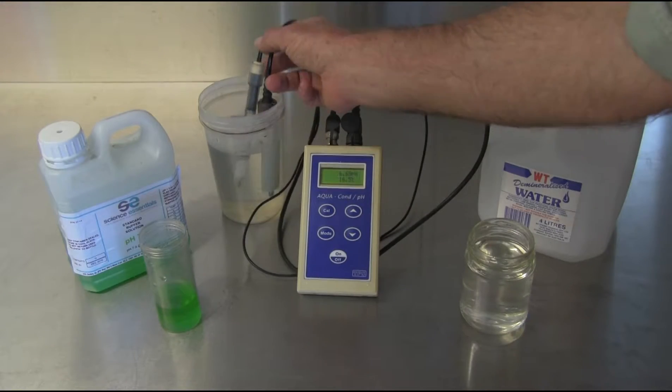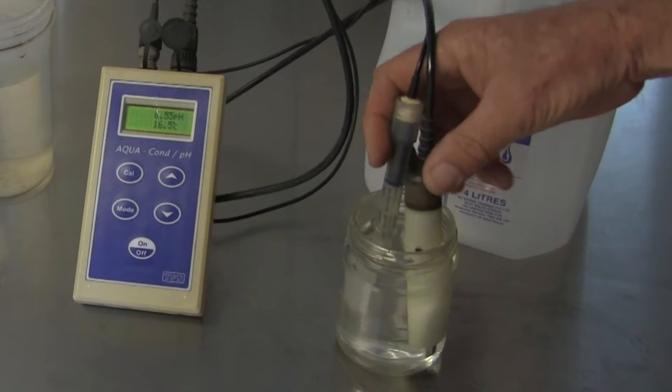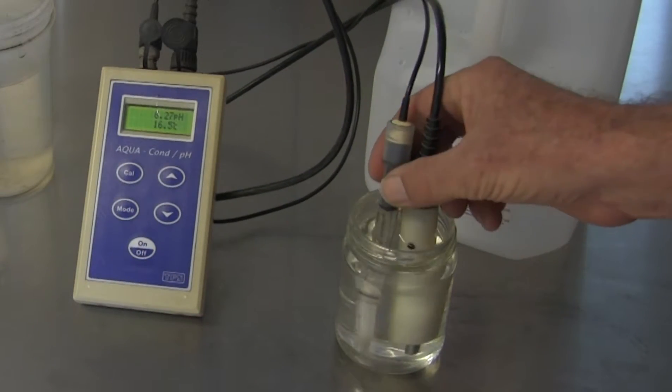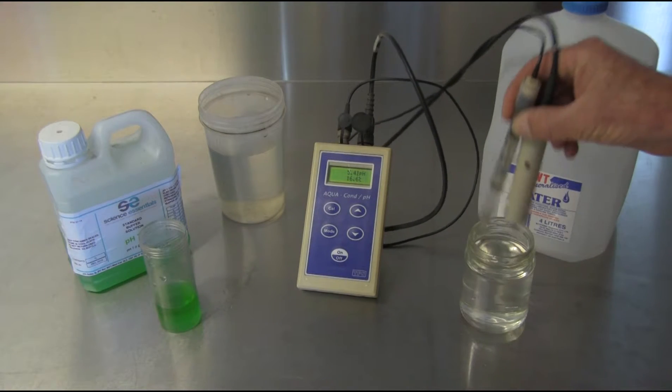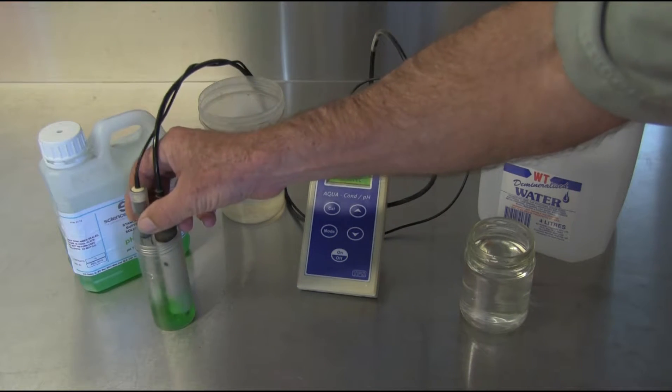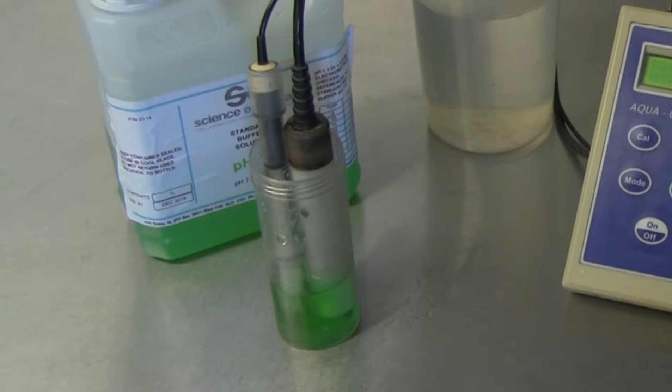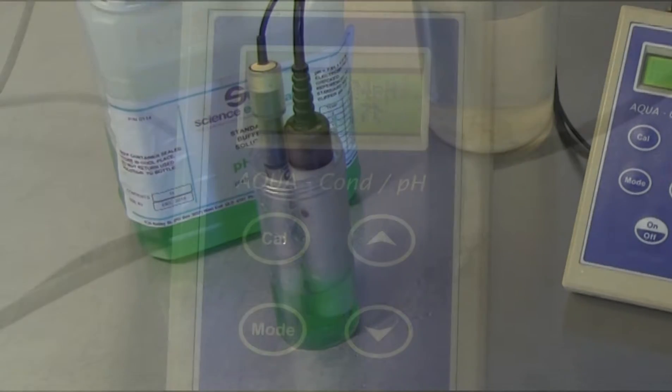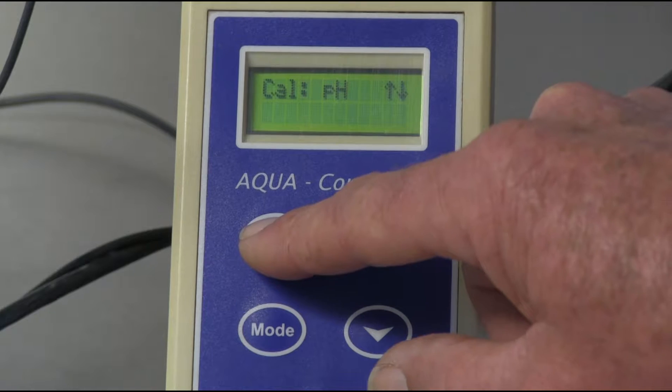Take the pH sensor out of the storage solution. Rinse the sensor with distilled water. Remove and carefully shake off any excess water. Immerse the pH sensor in a small quantity of pH 7 or pH 6.88 buffer, ensuring the end of the sensor is submerged to a depth of 2 to 5 centimeters. Allow the pH reading to stabilize, then calibrate the meter according to directions.